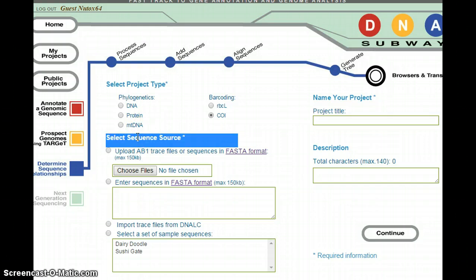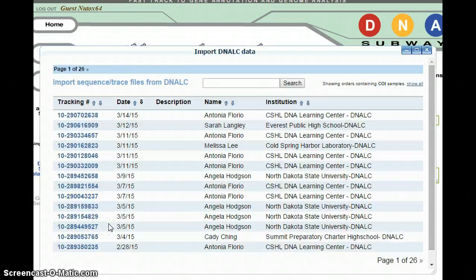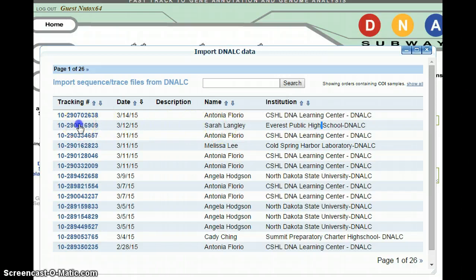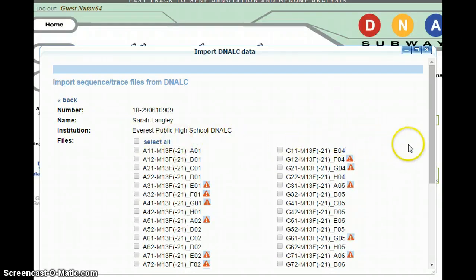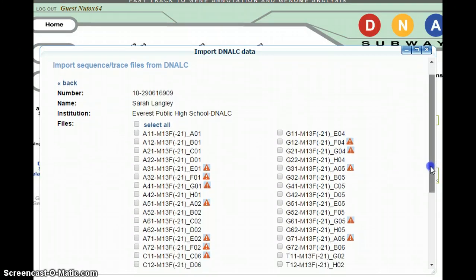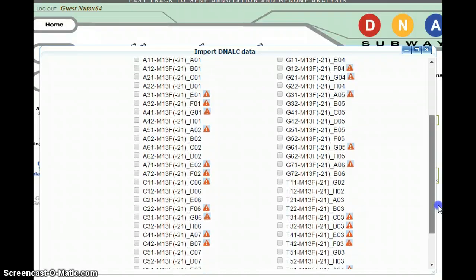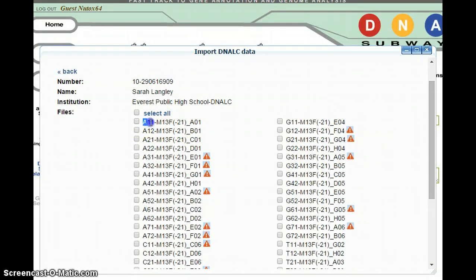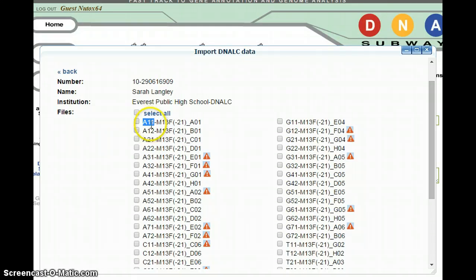Next, under 'Select Sequence Source,' you want to click the button that says 'Import Trace Files' or 'Import DNA LC Data.' When you click on that button, you'll see my name pop up — Sarah Langley, Everest Public High School. Click over here to the left to open up that information. When you click on that link, you'll get a long list of all of our samples for each of the four sections in biology. You'll see that for each sample it's listed by section name, team name, and sample number. For instance, this first one is Section A, Team 1, Sample 1. The second is Section A, Team 1, Sample 2.